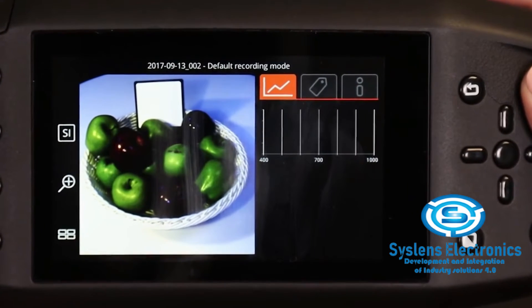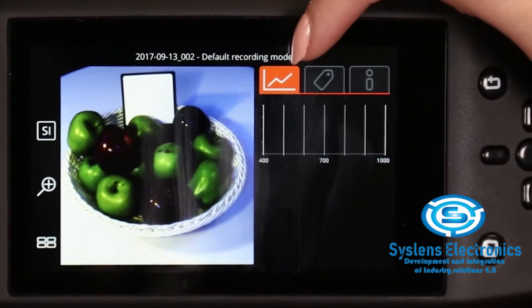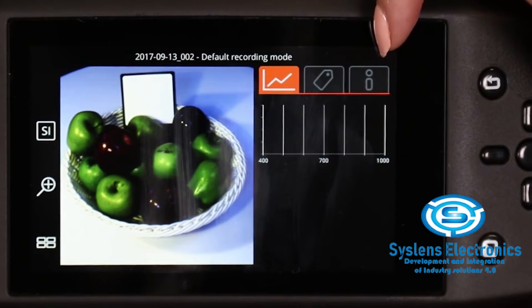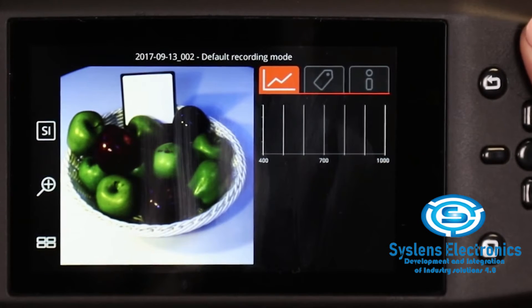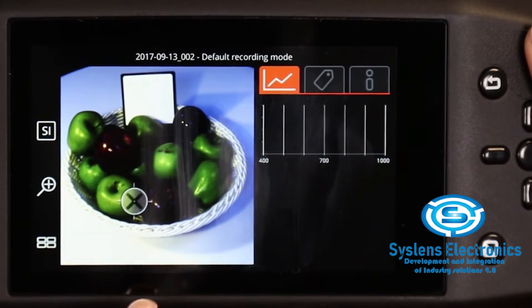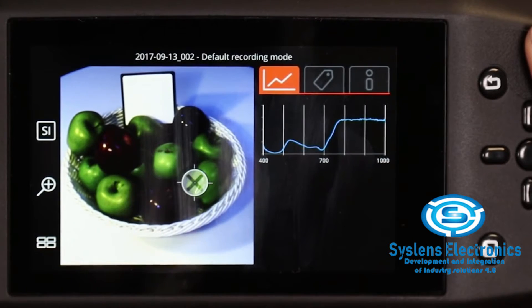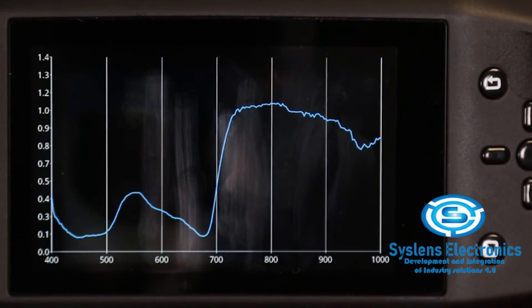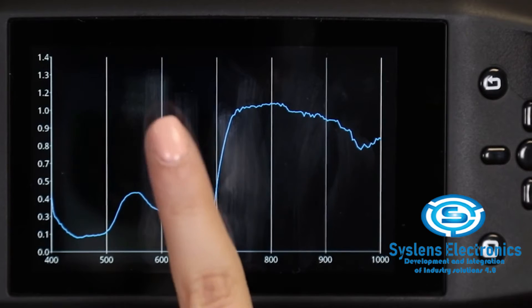On the right-hand side, you can see three tabs: Research, Tag, and Info. At the moment we are on the Research tab, where you can examine the spectrum of different pixels by touching the pixel on the screen. To enlarge the spectrum graph, tap it on the screen. To minimize the graph again, tap it again.